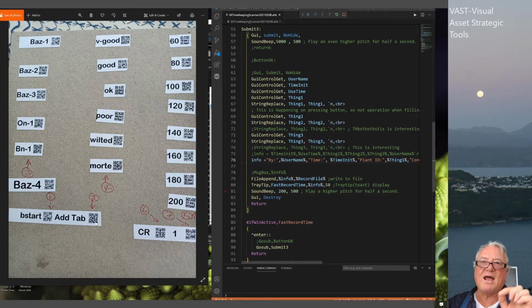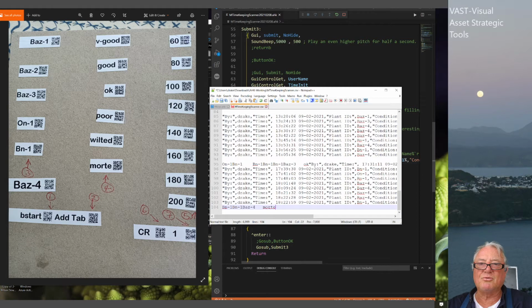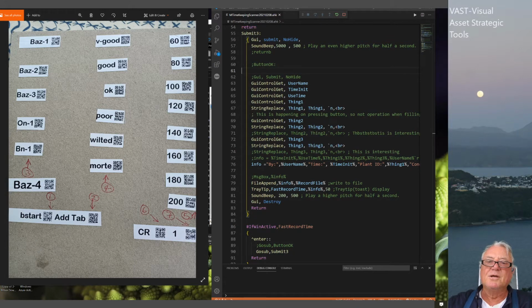Now I want to talk about another thing with the barcode scanner. To actually program the barcode scanner, if we go into a file through here, this has actually scanned something, so it's going to beep and scan more again. If I want to tab across, I've got to program onto the barcode scanner a thing called add tab. That barcode will go into the scanner, but it won't go onto the computer, whereas all of these other ones get read by the scanner and then sent to the computer. So that was the thing.